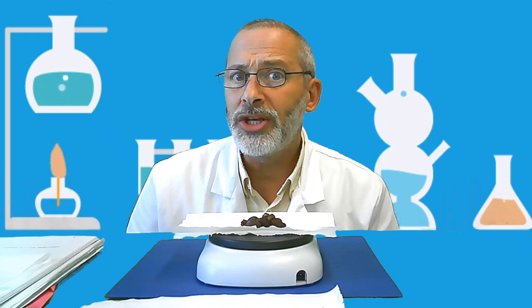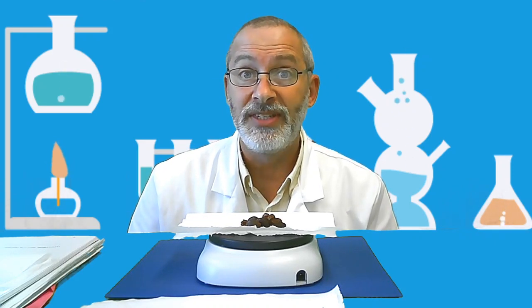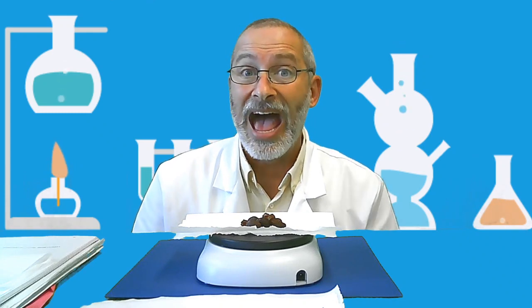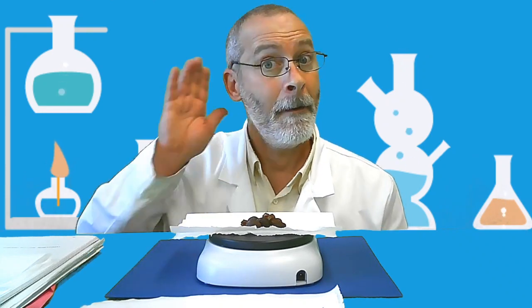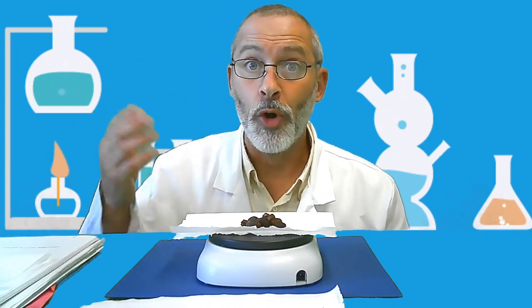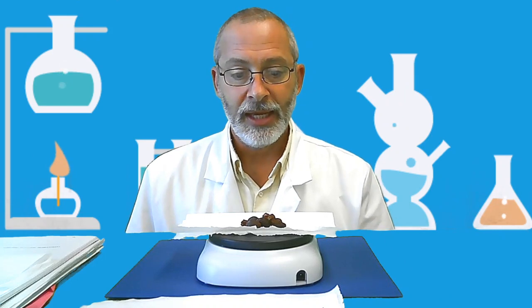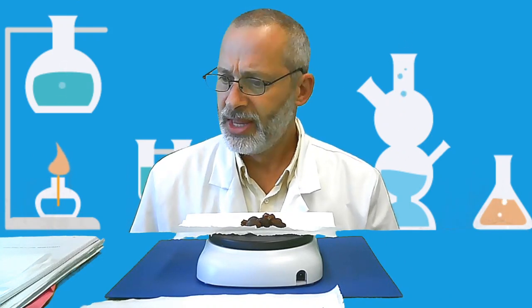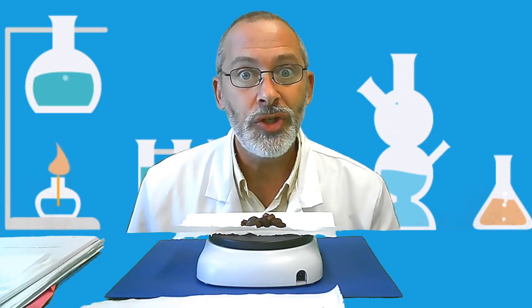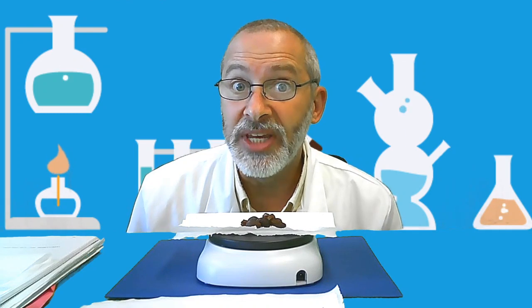So a little question for you. If 10 of them all have a mass of 10 grams, what would be the average mass of each individual raisin? Hopefully you said 1 gram, which would be correct. Yeah, each of these raisins, well, think about this. Think about what they were yesterday and think about what they are today.